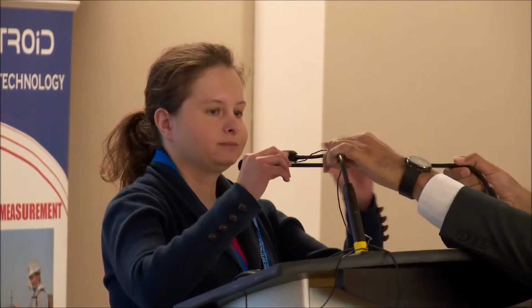Today I'll be presenting on the detailed characterization of odors, specifically with volatile organic compounds and reduced sulfur compounds.